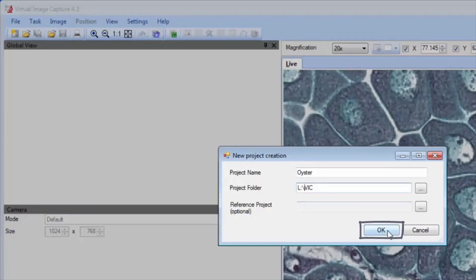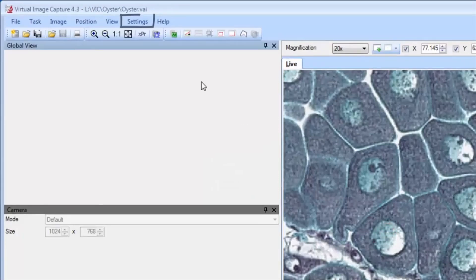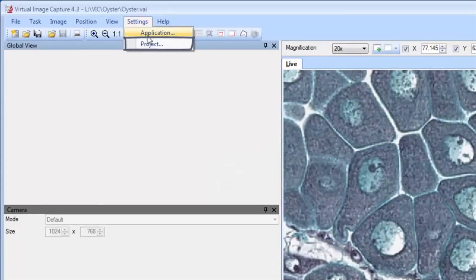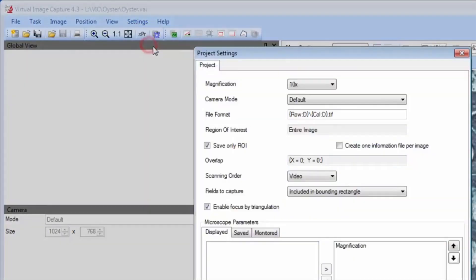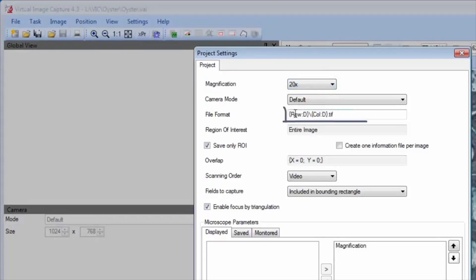Next, the project settings are defined using the Settings Project menu. The lens magnification is selected that will be used for image acquisition, and the image file name format for the saved images is defined.